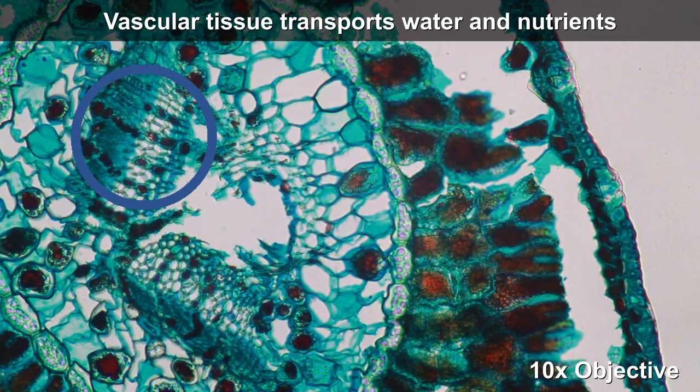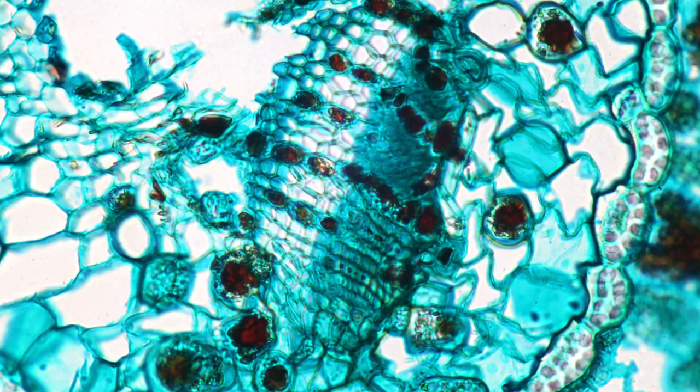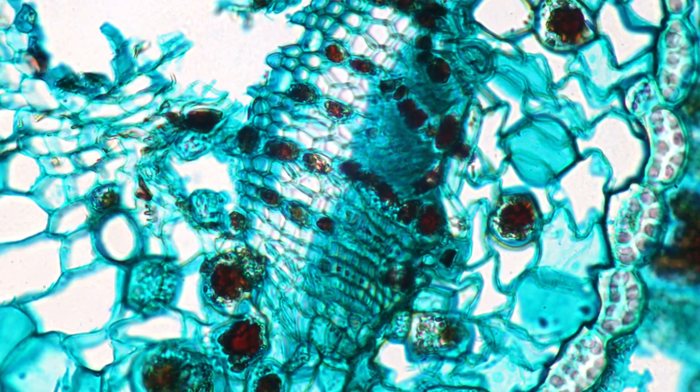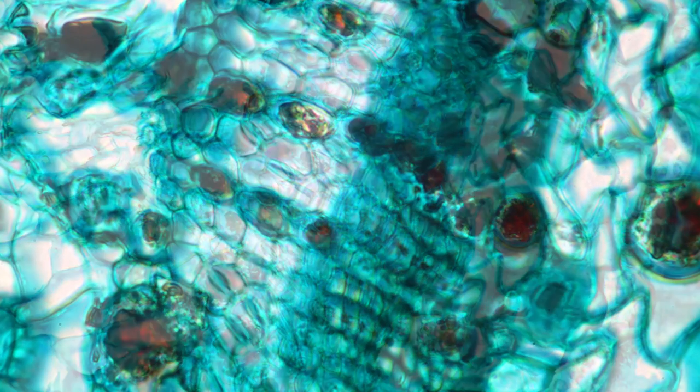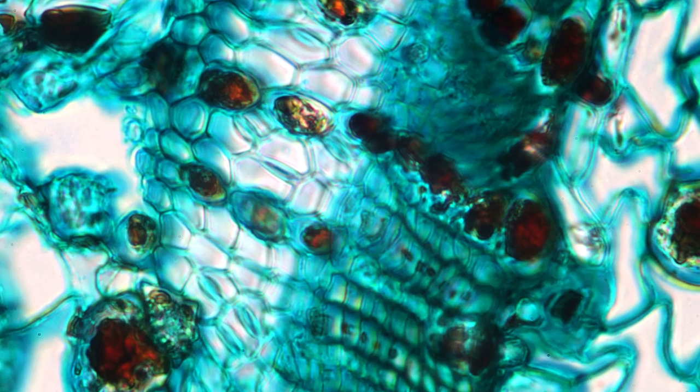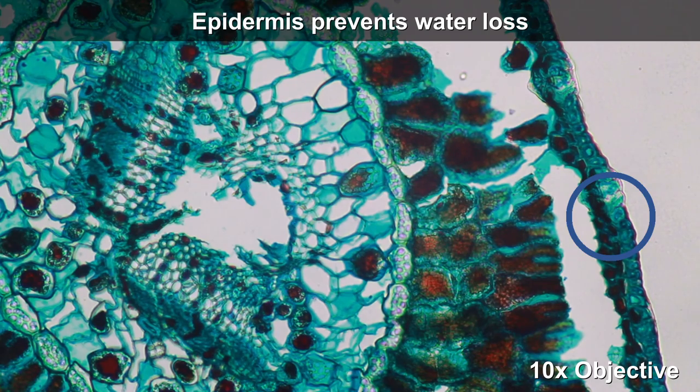It is the vascular bundle. Here we have a close-up, and this is where substances are transported to and away from the leaf. The water is transported to the leaf, and the sugar is transported down to the roots.